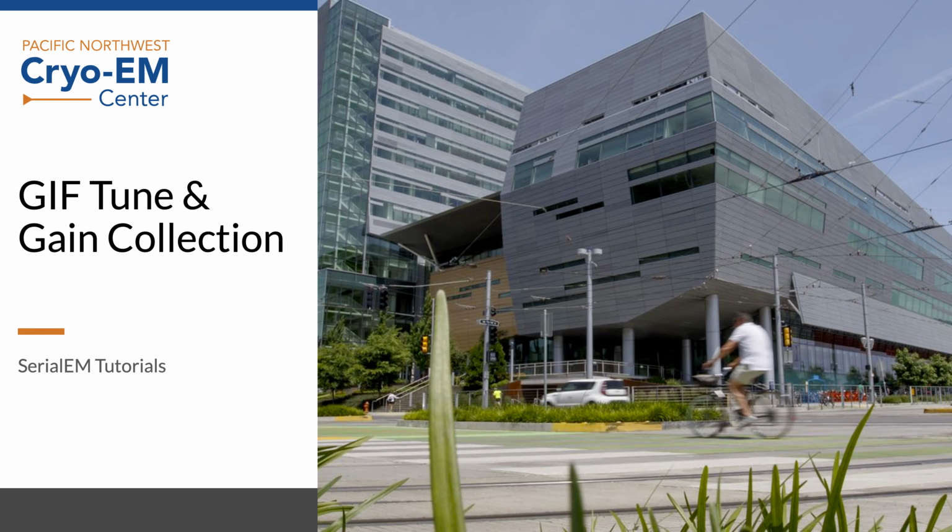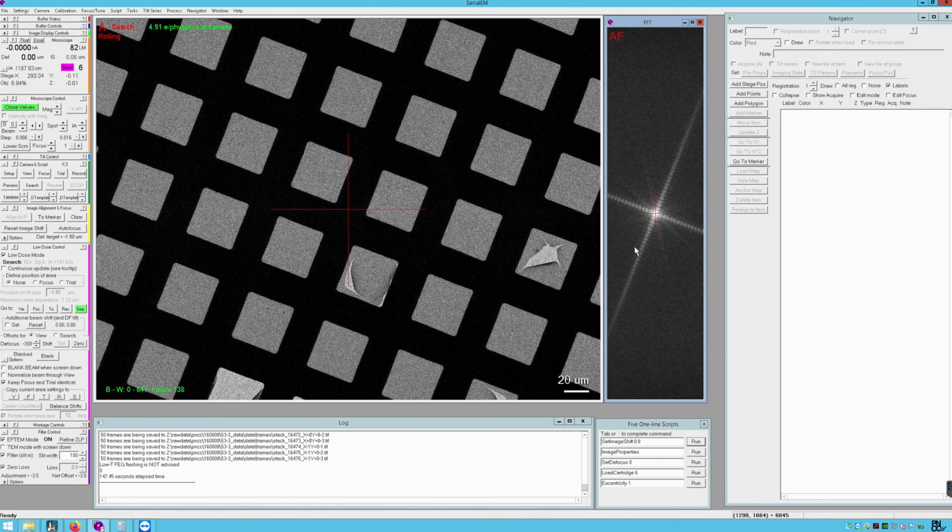In this video, I will be tuning our BioContinuum energy filter and collecting the K3 camera gain on our Krios equipped with a Cold-FEG. Want to navigate to a broken square? I'll choose this one here, go to marker. Take search to verify.